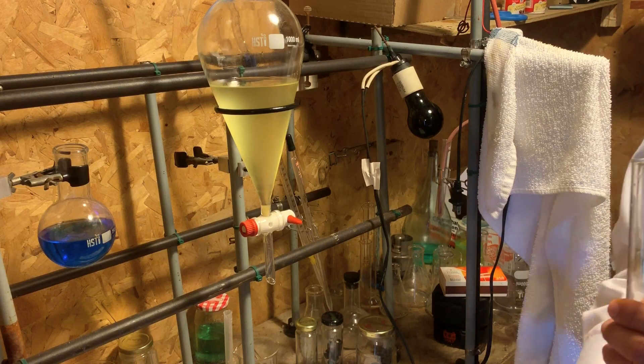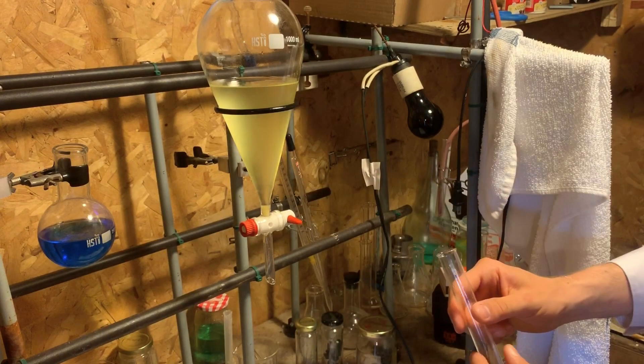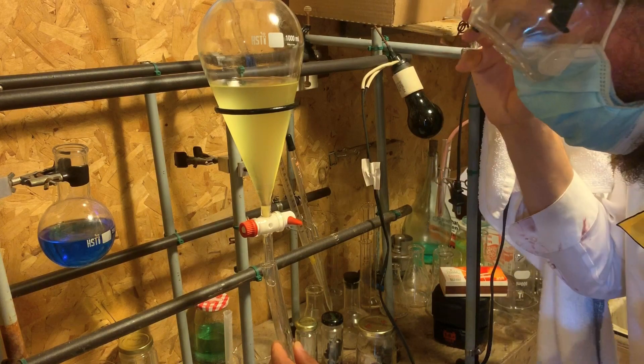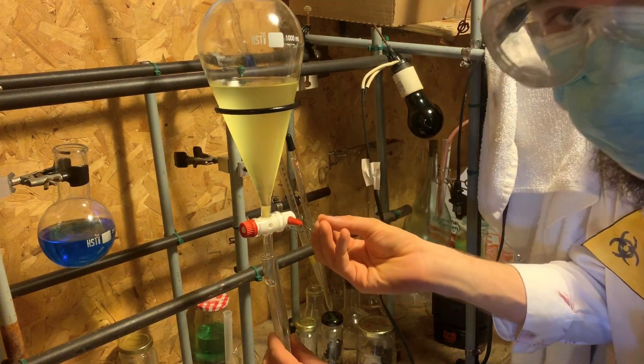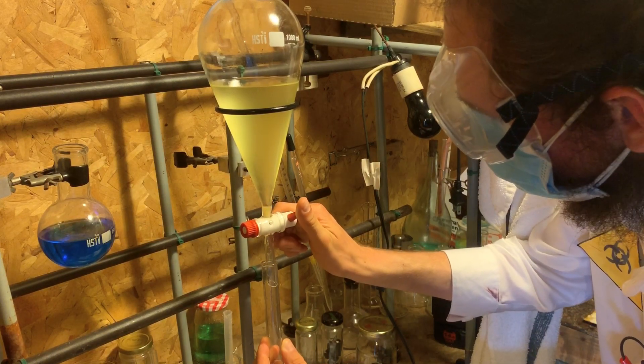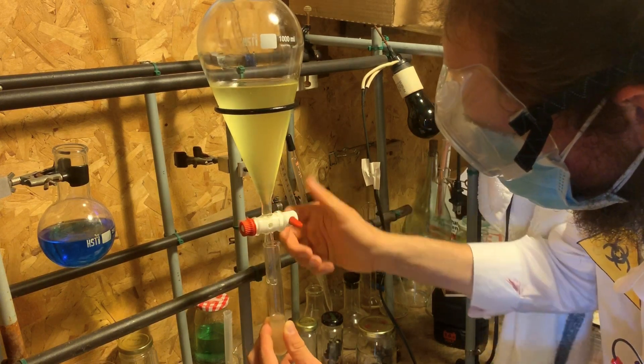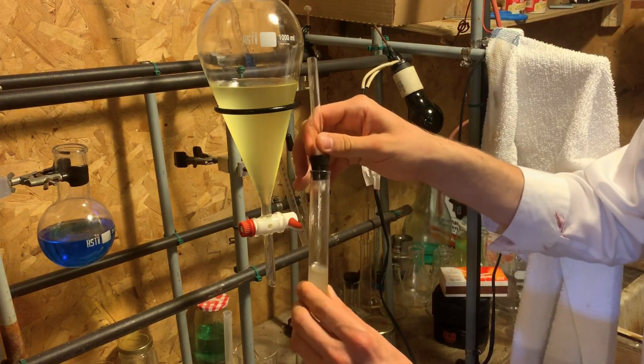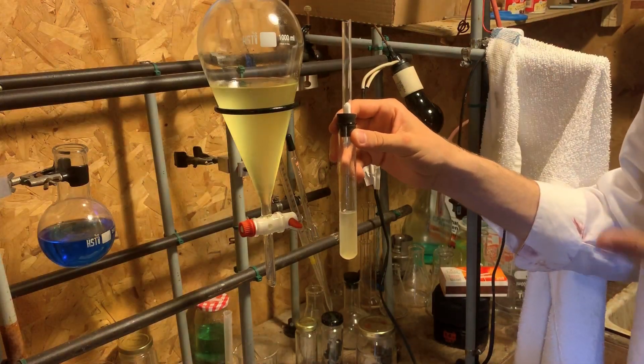Now from here I'm going to collect our bromoform and put it in this test tube. Keep in mind bromoform is very dense so it has sunk to the bottom. I'm going to collect it. Okay, that's it. I'm now going to cap it off with a rubber stopper and place it on this clamp over here.